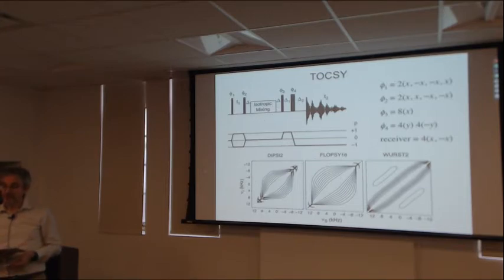And the proton-proton J couplings, say the H-alpha amide couplings, range from about 2 hertz to 12 hertz. So when you get to a protein of, say, 150 amino acid residues, these sequences are starting not to work so well.